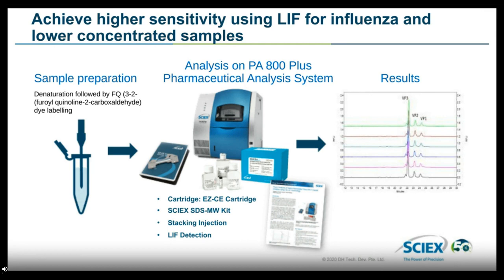And here you have to prepare the proteins. So typical approaches for preparing the proteins, which is basically derivatizing the proteins so they can be detected by the LIF detector, is to add derivatizing reagents to your samples. Typically, these reagents were examples like FQ or TAMRA, and this complicated the process to some extent because it added a variable and also involved you doing some sample prep, including reconstituting the sample in different buffers for the FQ to work. However, this really did improve the sensitivity, and so what it showed is that the sensitivity was improved by 2 orders of magnitude, by nearly 100-fold, if not greater, when you moved across to laser-induced fluorescence.